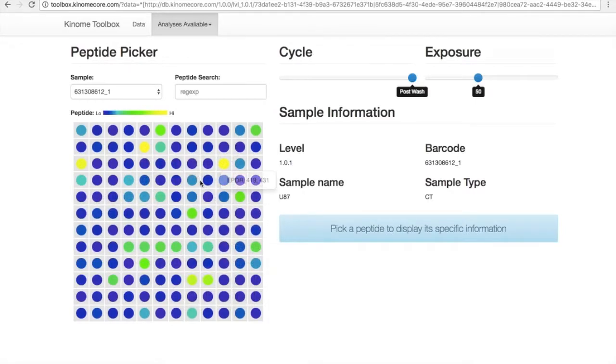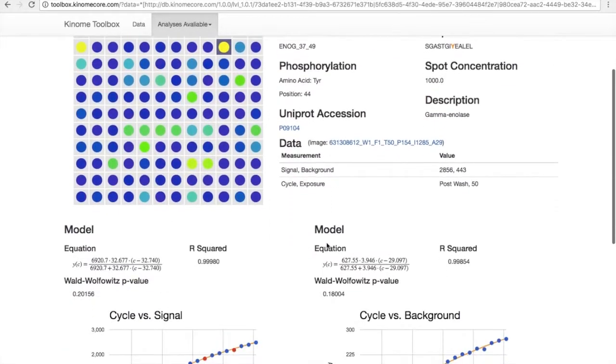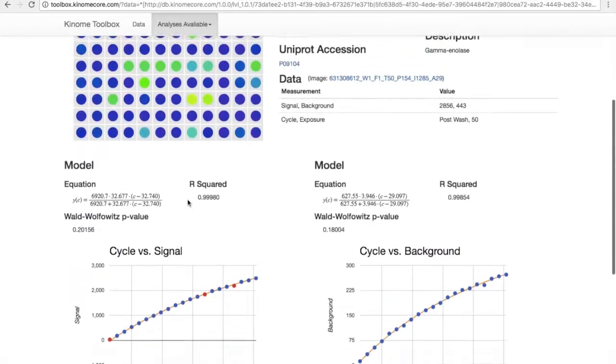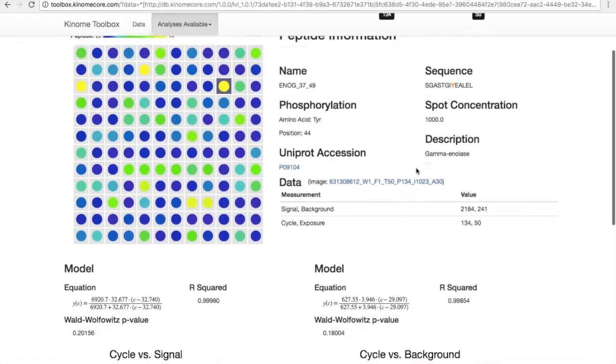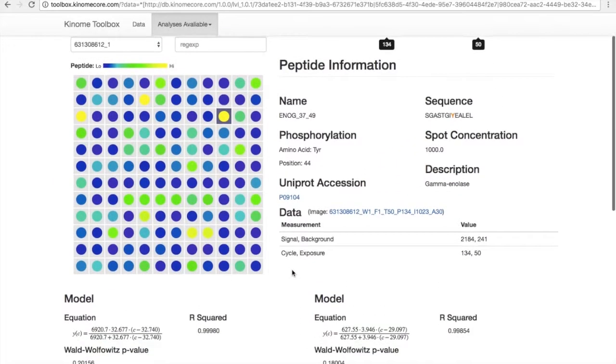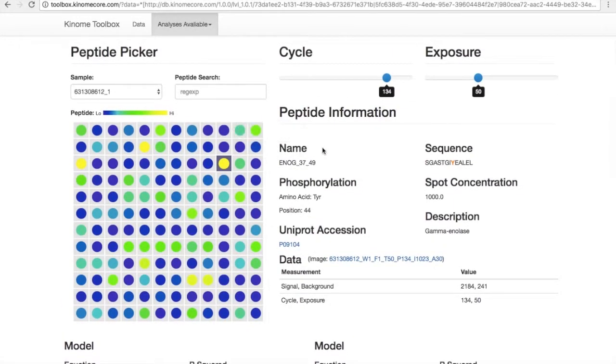This entire grid is once again color-coded. This time it's color-coded by the strength of the signal. Now we can scroll down and take a look at different data points just like we have before and see how things are affecting the fit. I will note that these outliers here in this particular sample don't look like outliers to us. However, the signal is very large here, so these could be much larger deviations than is obviously visualized. This is the same viewer as in the last video, so I won't spend very much time on it.